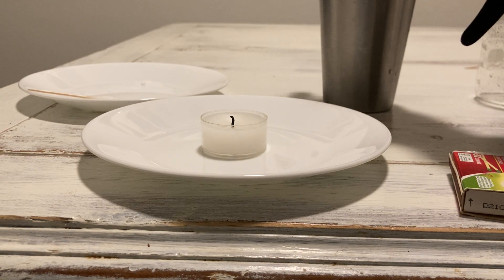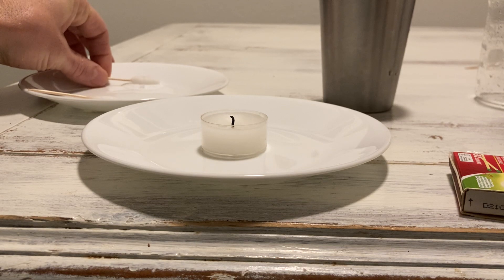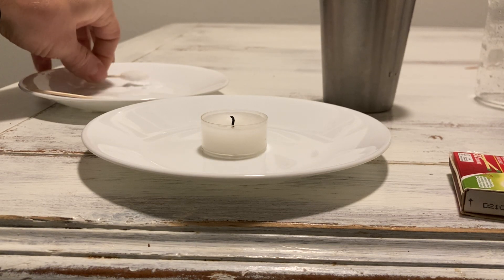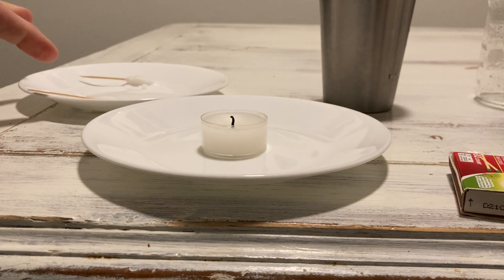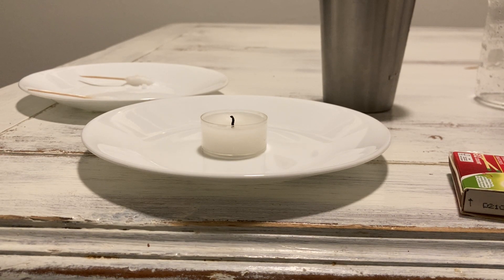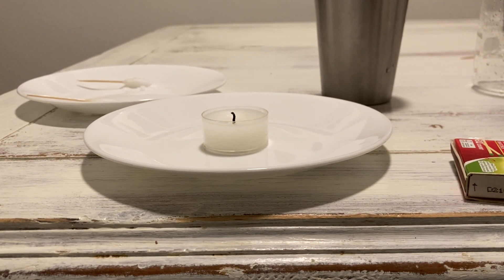Now we'll do the salt substitute — it looks a little finer than regular salt, but that just depends on what kind you buy. We're going to light this up, turn the light off, and see the different colors the flames produce. Sodium chloride — it's the sodium — should give an orange-yellow color, while the salt substitute should give a lilac color.